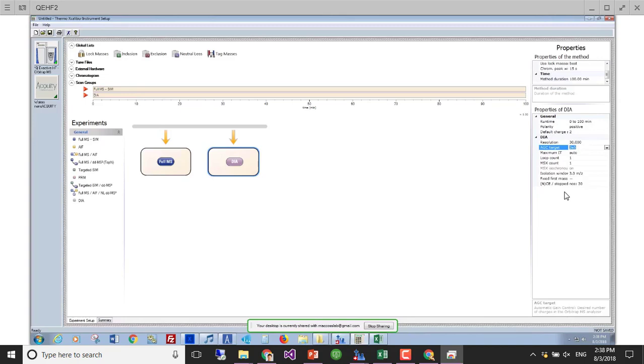Now, with DDA, you really gain an advantage from being able to run the orbitrap as fast as possible, right? So if the orbitrap fills its AGC target really quickly, then you can start the scan, and then you can keep going on to the next scan, and maybe that scan is substantially shorter than it would otherwise be. Does that kind of make sense?